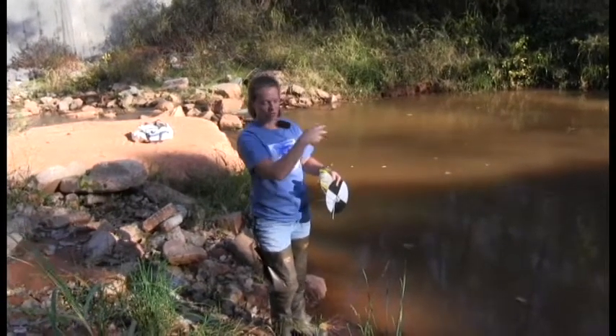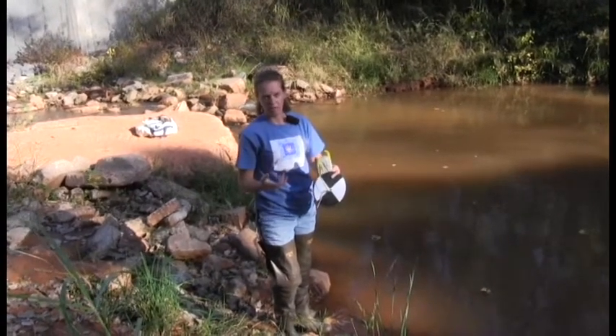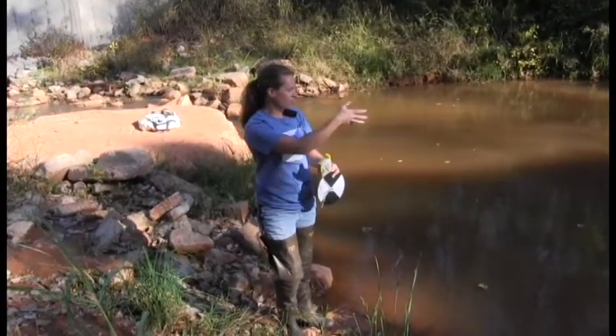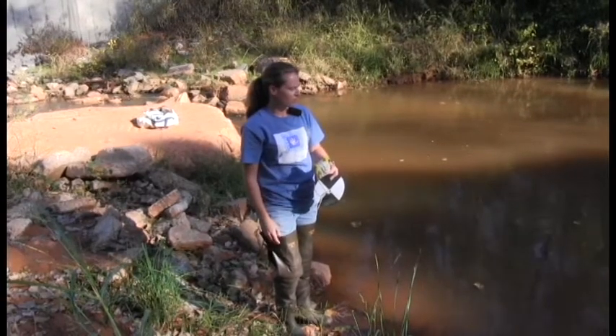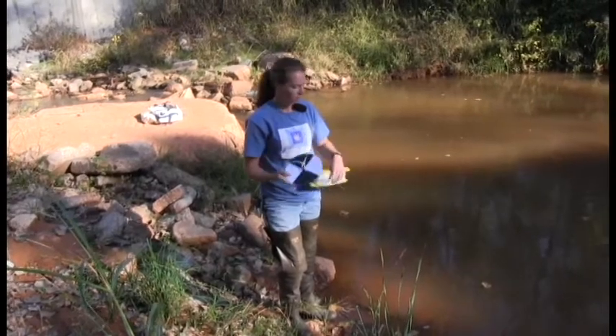We've come downstream just a little bit, and as far as secchi, this is measuring for the clarity of the water. Right now it looks pretty dark and murky, but to actually test and see the depth of it, we're going to use the secchi disc.